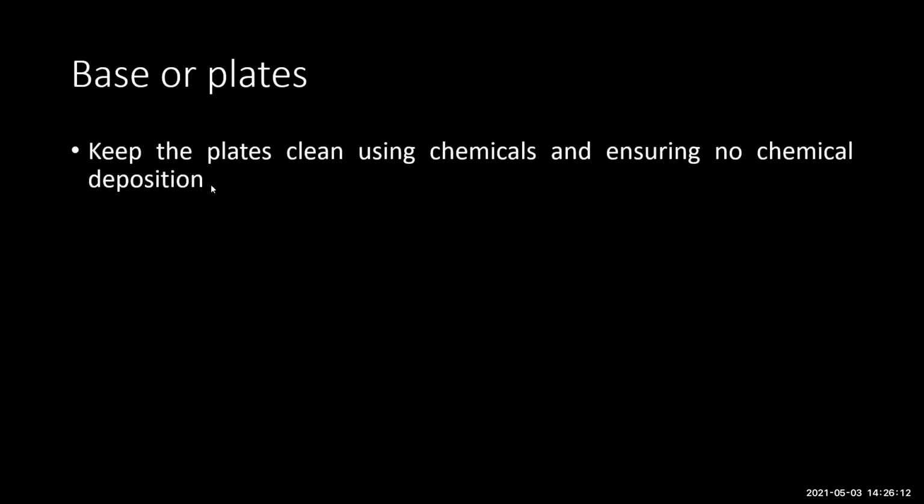So, what are the base or plates now? Keep the plates clean. Make sure it is kept clean because once you apply the gel, it's not as easy as removing the paper. Once you apply the gel, it needs to be completely removed for many reasons. One among them is chemical interaction between the sample and the stationary phase.